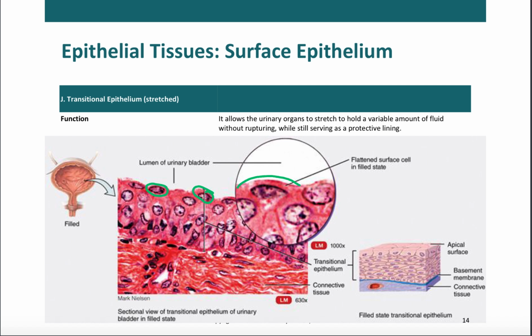So, if you see lots of layers with weird shaped cells and the topmost layers don't look like someone sat on them and squished them flat, that's one way to know it's transitional. So uneven cells, kind of like stratified squamous, but the topmost layer isn't absolute layers and layers of squished cells, transitional.